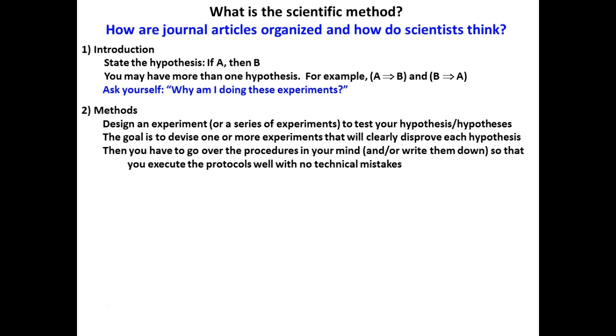In this lab, sometimes we'll have to repeat, especially when you're trying to figure out your unknown. For these, you're just learning. If you mess up, just document where you went wrong, look at someone else's slide. So, how do I perform these experiments properly?